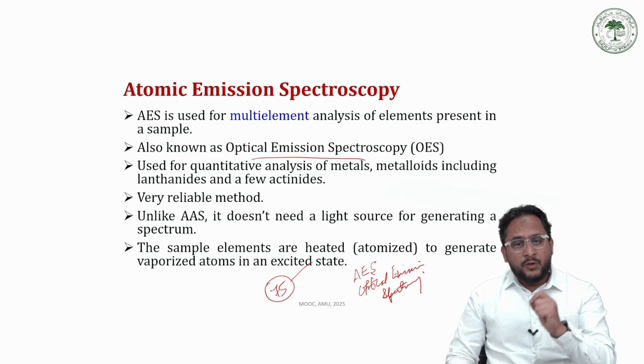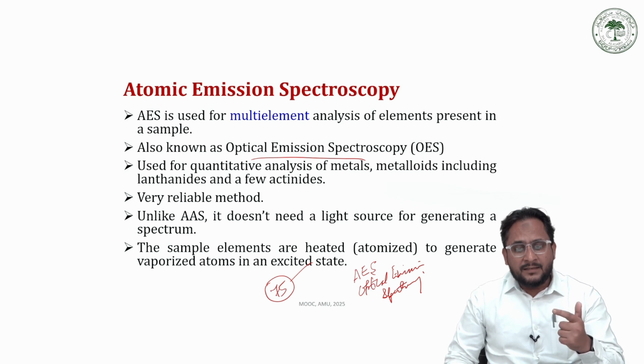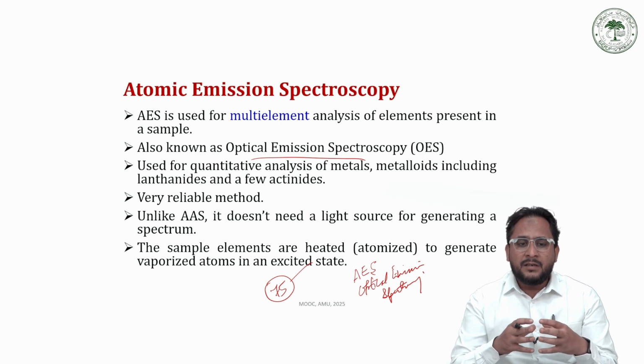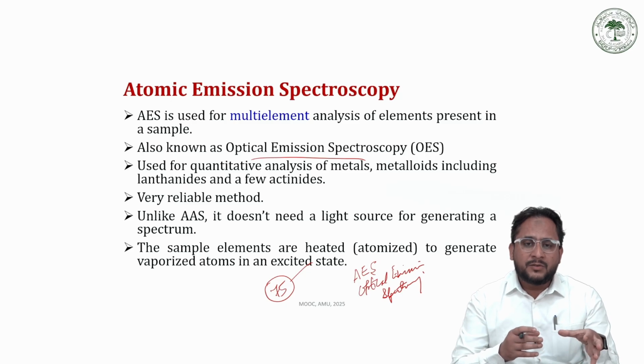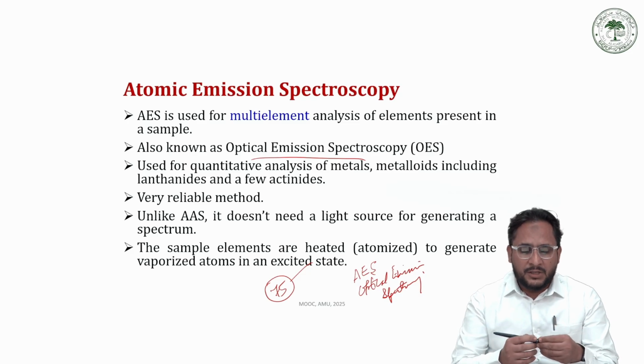But since we do not need a light source in this case, we excite the sample by thermal energy, and therefore the thermal energy required in atomic emission spectroscopy is quite high compared to the requirement of heat in atomic absorption spectroscopy.